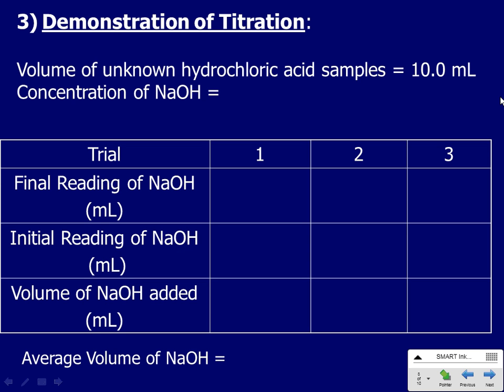And then hopefully you'll be able to grab 3 Erlenmeyer flasks. There might not be enough Erlenmeyer flasks, so you might only have to work with 2, and then you'd have to dump them and then reload and do the titration 2 more times, because you sometimes have to do 4 titrations. I will be writing all this information down on the whiteboard or the chalkboard so that you can quickly take a glance, and all the glassware is up in the cupboard. It's very easy to grab it.